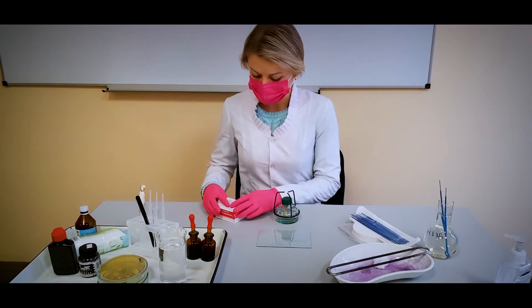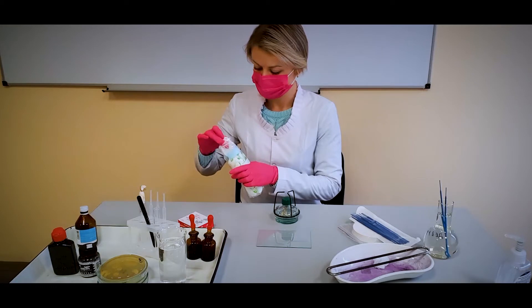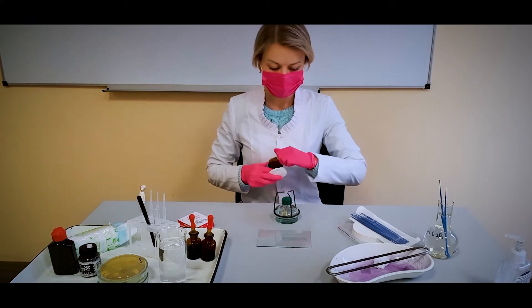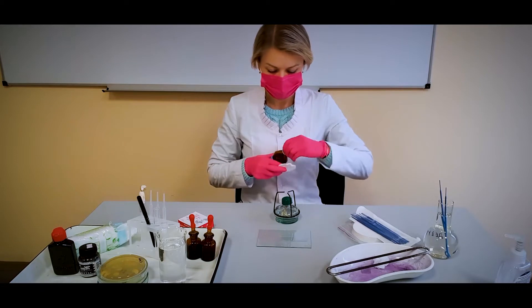I will show you the Burri-Gins staining technique for detecting capsules in bacteria. Most bacteria have some kind of capsule. This viscous surface layer is also known as the slime layer, the glycocalyx, or the extracellular polymeric substance.